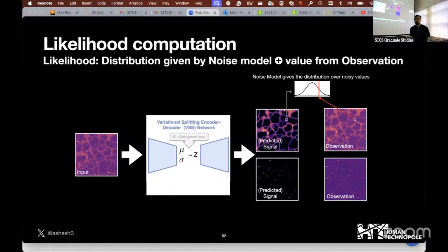Yes. Even on the same microscope, you might have different types of noise. Typically, you have Gaussian and Poisson noise. These are the two dominant sources, right? Both are pixel-wise independent, and so they can be modeled in this way. You have autofluorescence and other kinds of issues, but that is something that we are not tackling here.